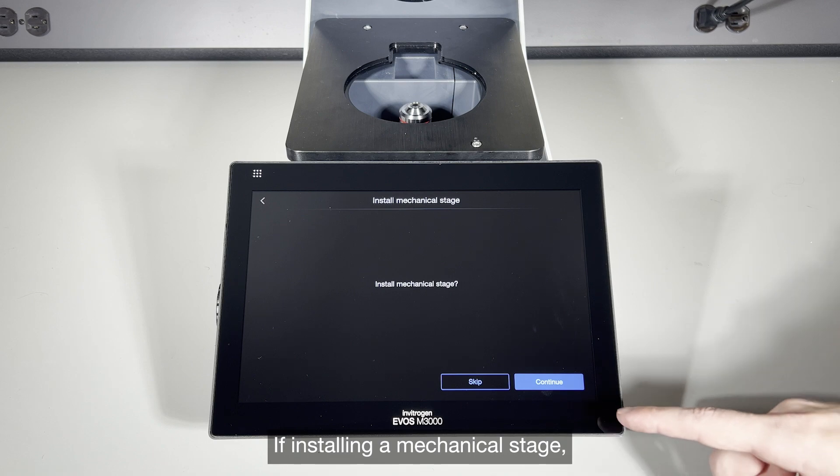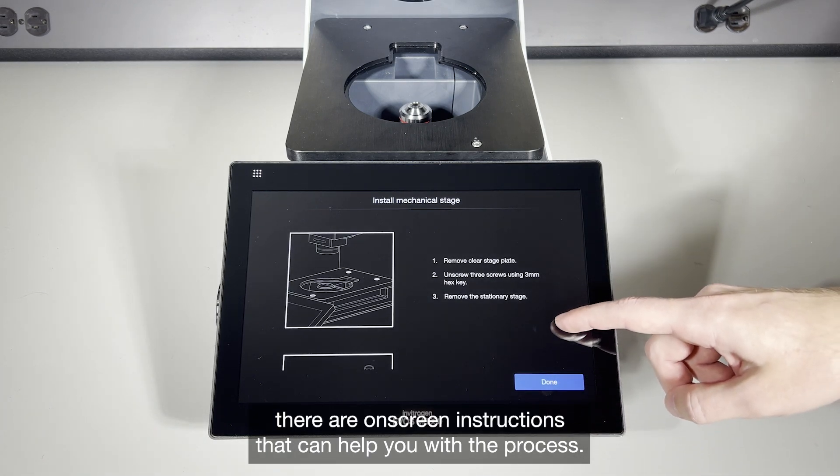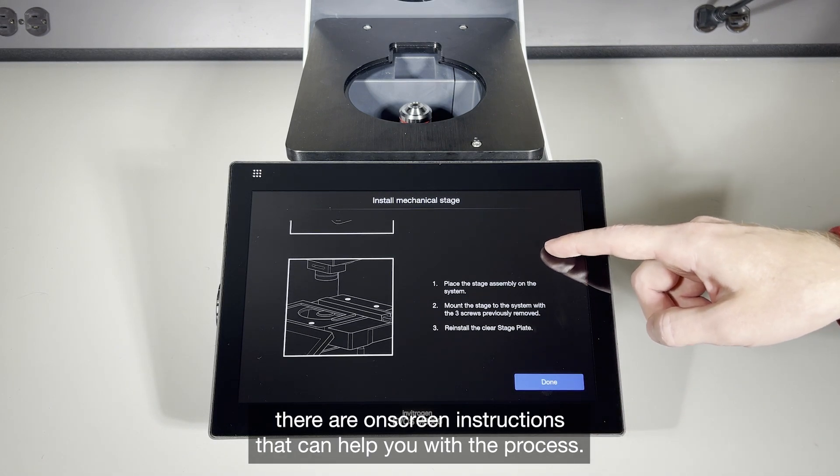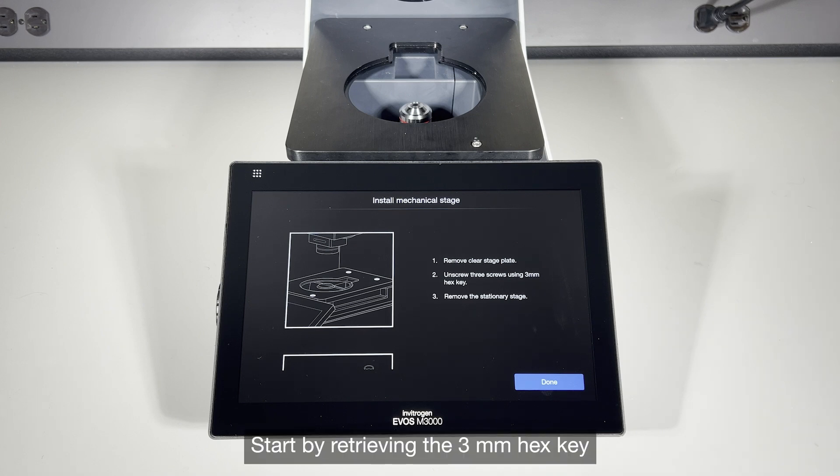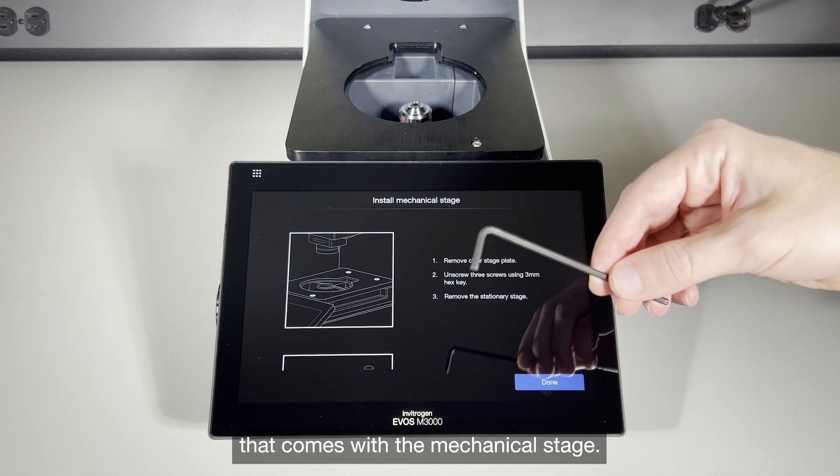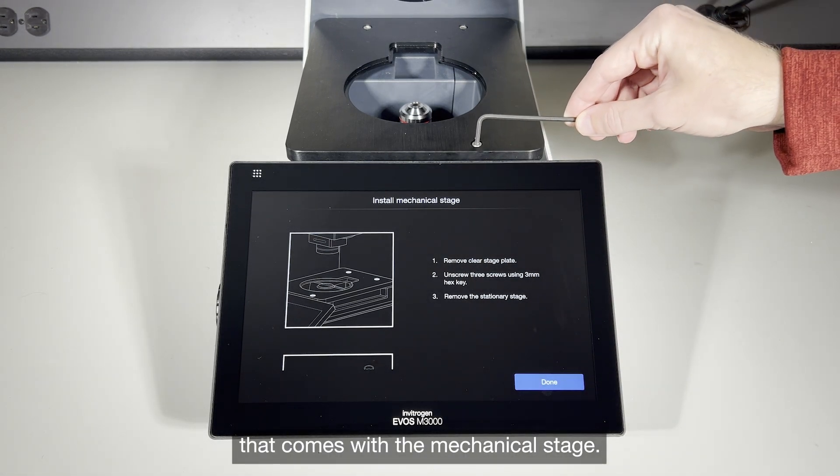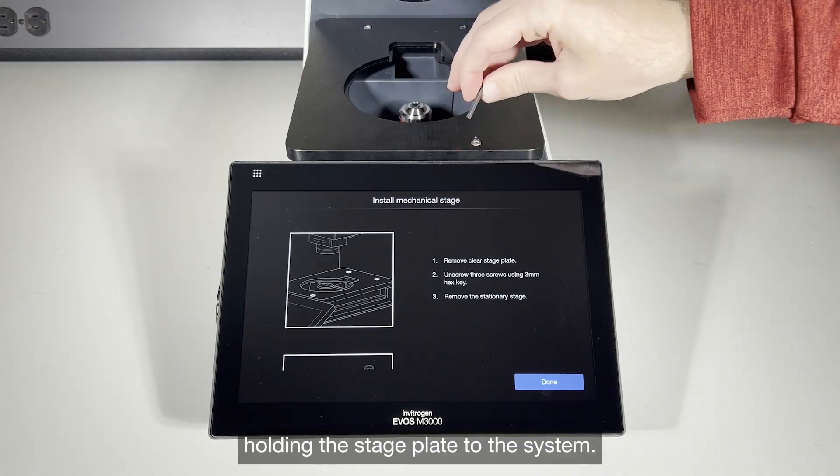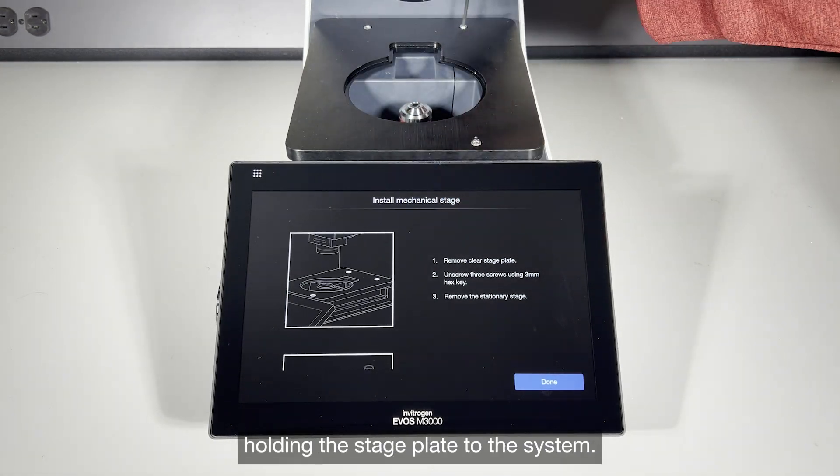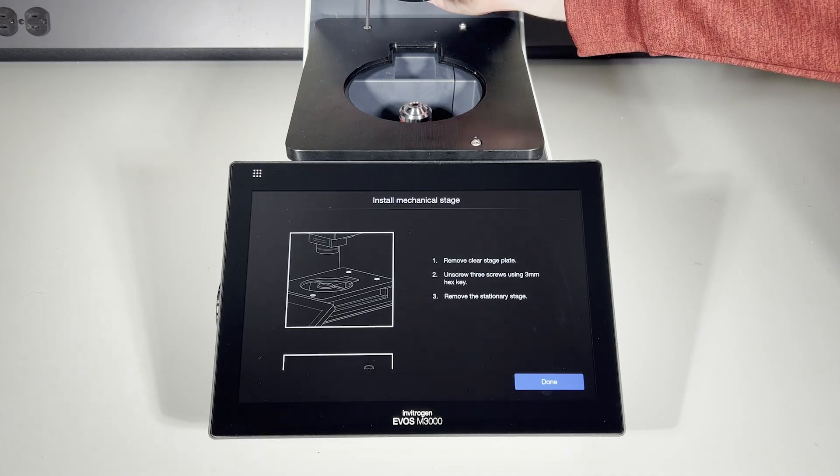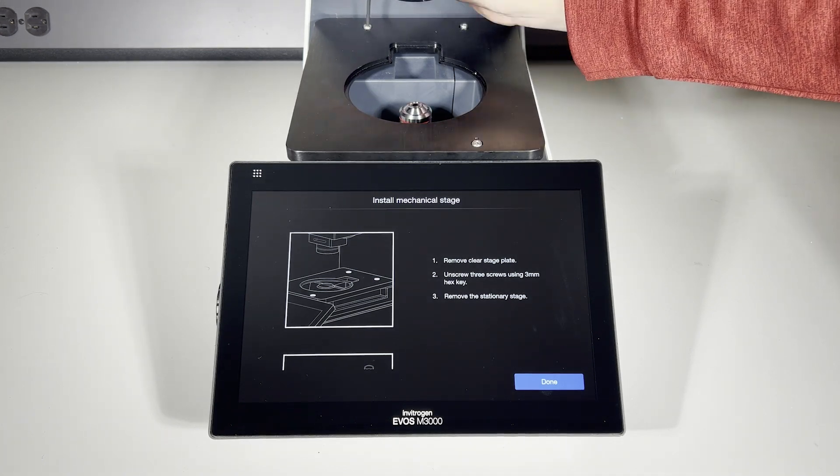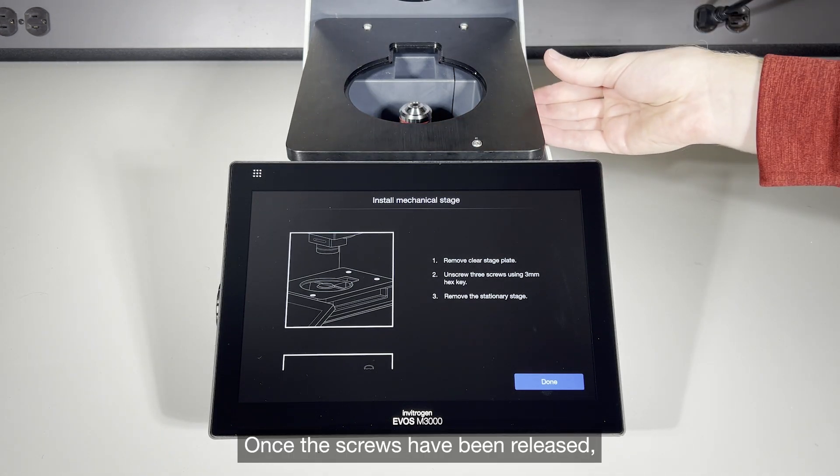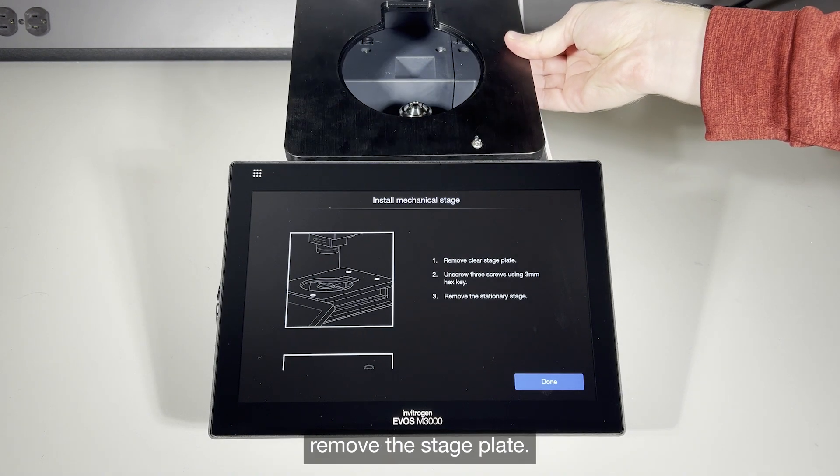If installing a mechanical stage, there are on-screen instructions that can help you with the process. Start by retrieving the 3mm hex key that comes with the mechanical stage. Use it to remove the three screws holding the stage plate to the system. Once the screws have been released, remove the stage plate.